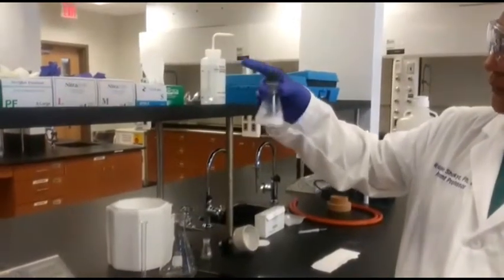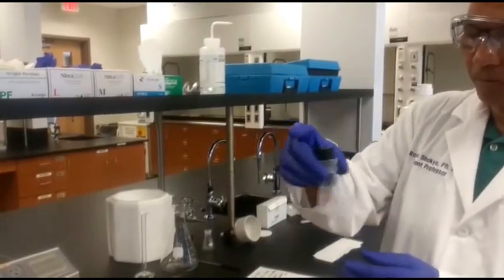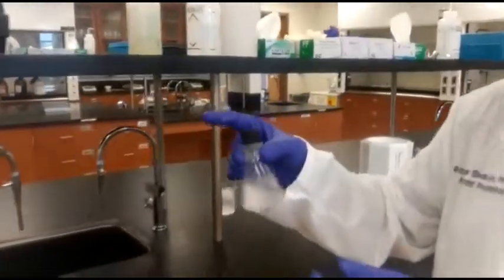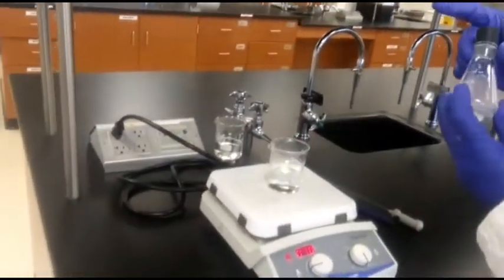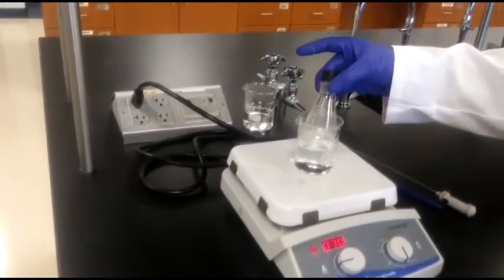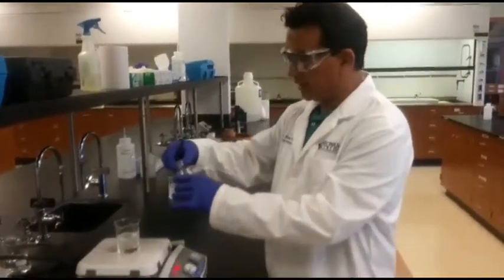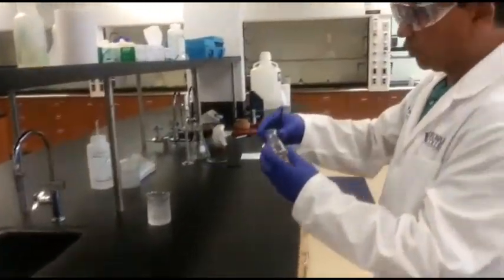So just let me swirl it for some time so that the reaction proceeds well, and then it can be kept in the hot water bath. The water bath is heated to a temperature of around 70 degrees. So that is where I will put this reaction mixture. It has been almost 5 minutes in the hot water bath, and see, this is forming a clear solution.